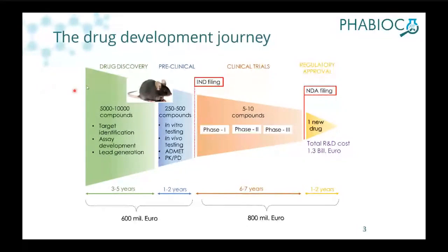This is also the part where the so-called druggability properties are measured, mostly the solubility of the compounds. In former times, the partition coefficient was very useful, and nowadays, the permeability.